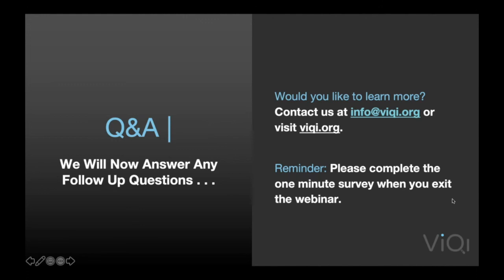That seems to be the language that nearly everyone has latched onto for doing this stuff themselves, programmatically, and using the raw tools to do AI work. If you're looking for sort of clicking kind of stuff, ViQi has a platform for doing this. Cell Profiler does also.